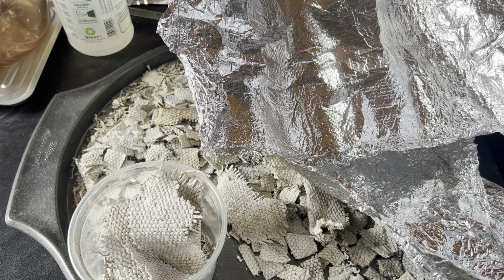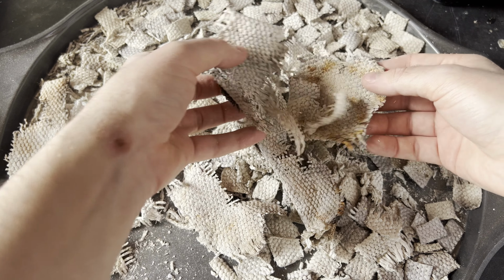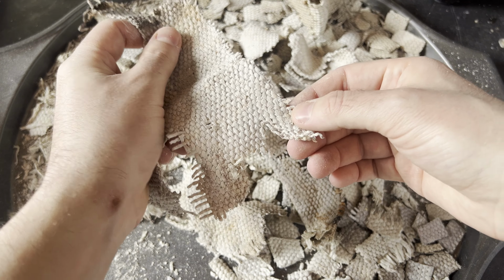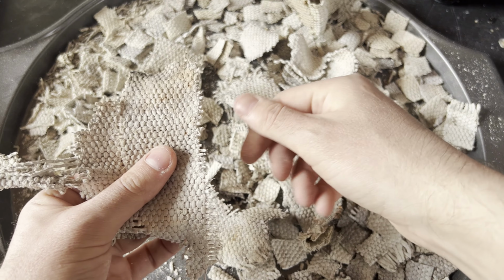The name stuck with the style, so sintered glass crucible funnels like this are also referred to as Gooch crucibles. The original Gooch crucible was made of platinum with a perforated base, sometimes porcelain instead of platinum in the rare cases that platinum couldn't be used.